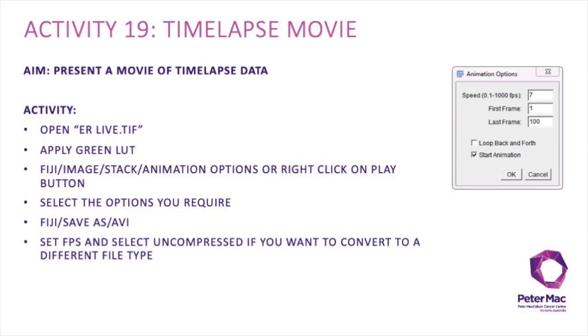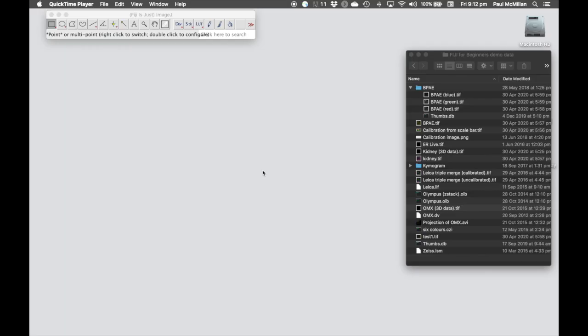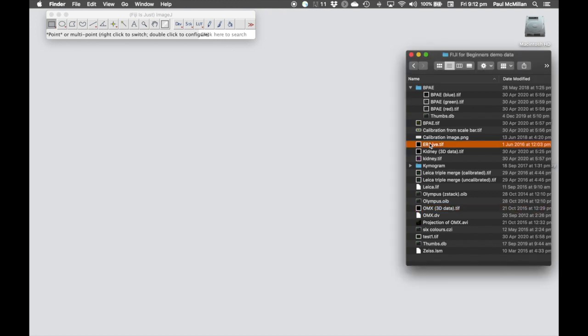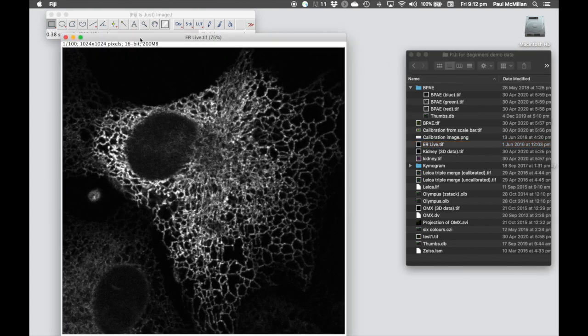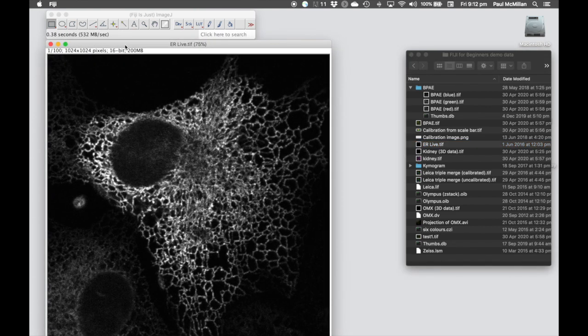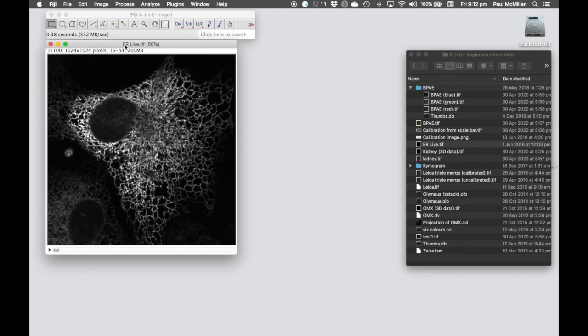Activity 19 is how to show a simple movie of time-lapse data. For this example, we are going to go into the erlive.tiff image, just rescale that so it fits the screen.